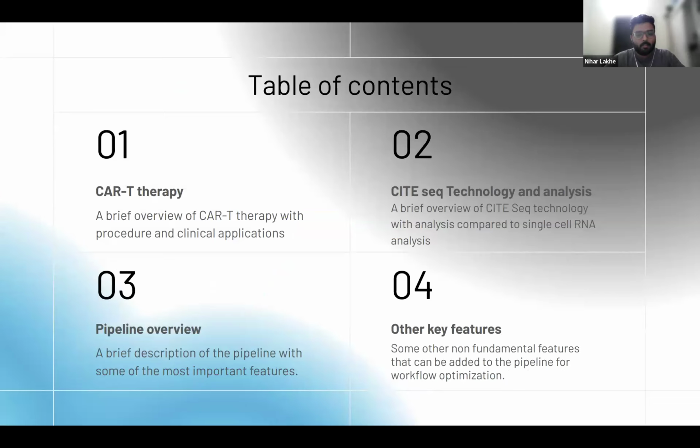In today's webinar, we'll be focusing on various topics. Firstly, on CAR T therapy, we'll be presenting a brief overview of CAR T therapy with its procedure and clinical applications. We'll be focusing on CITE-seq technology and its analysis and how that would help in CAR T therapy. We'll also discuss the design of the pipeline and its overview, how we can scale the pipeline for using CITE-seq to better provide the CAR T therapy, and other key features that can be included in this pipeline.